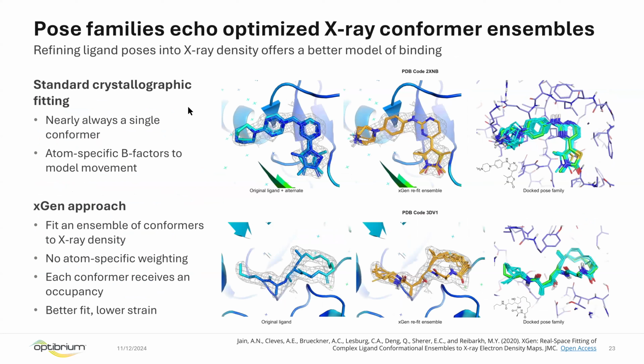One thing that Anne mentioned that I want to touch back on, which we brought up actually way back in 2015 with this ligand of 2XNB, is that in the crystal structure, there's actually two alternates that were fit to the density. In particular, both down here where this little, I think it's a thiazole binds, you see two flips over here. You also see some variation in the amine-containing moiety that is extending towards solvent, which you would expect.